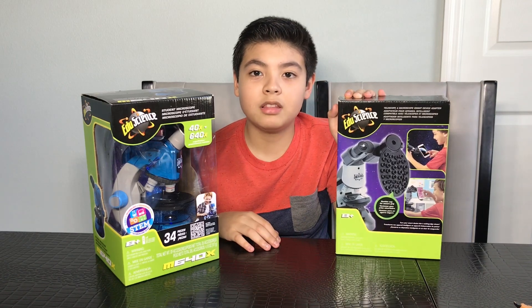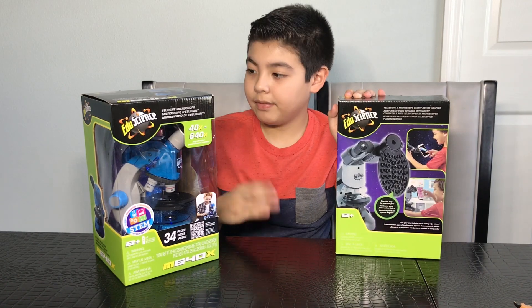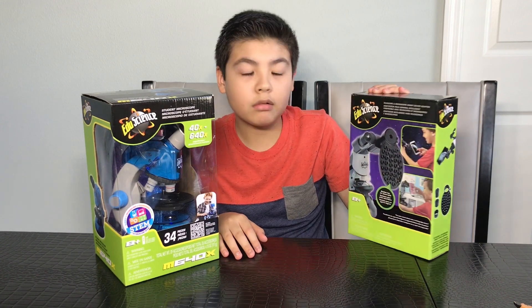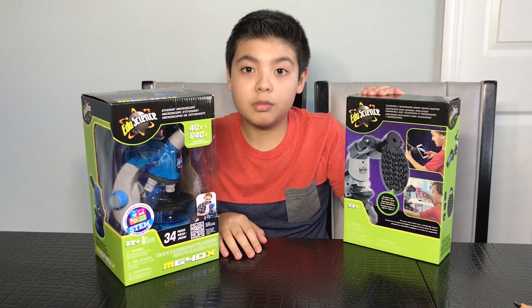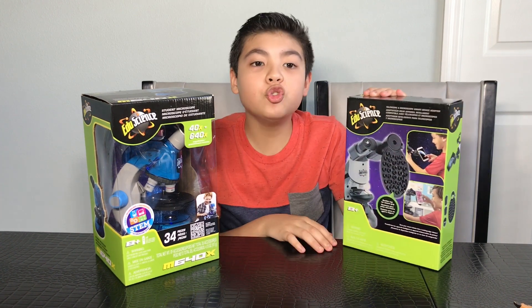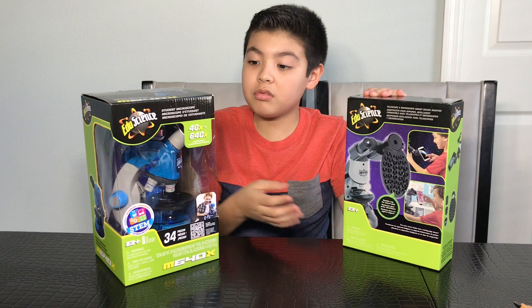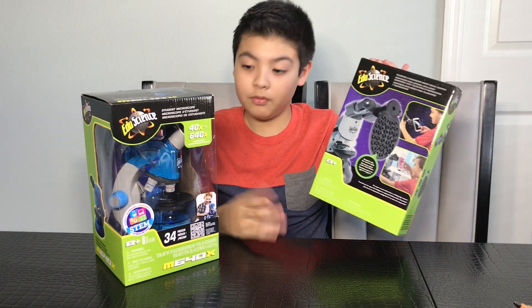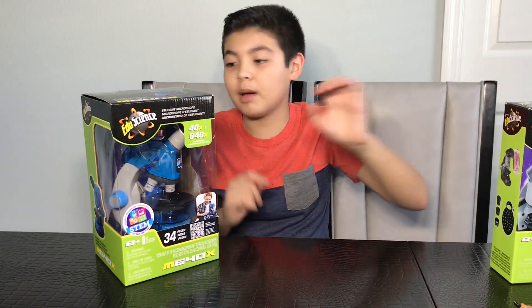Welcome back everyone on the Toys You Play. This is Aiden here. Today I have the EduScience Microscope and the EduScience Telescope and Microscope Smart Device Adapter. You put your phone on the suction cup and you can see what I'm seeing. First we're going to open up this and get the slides ready, and then I'm going to put the phone up here so you guys can see what I'm seeing.